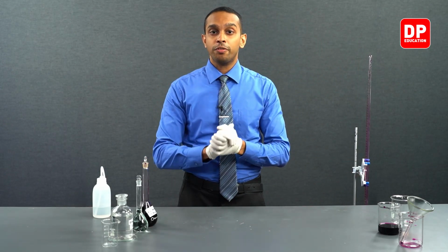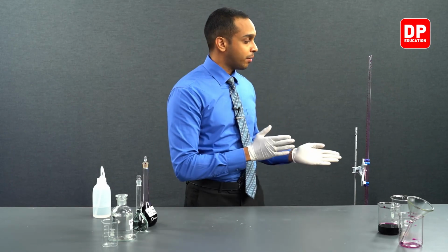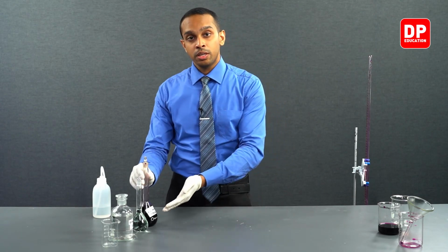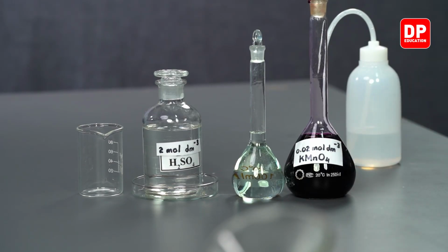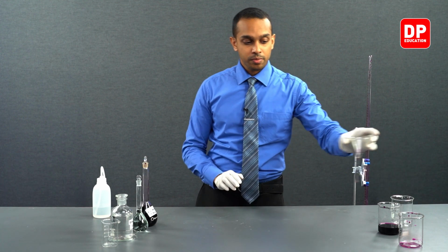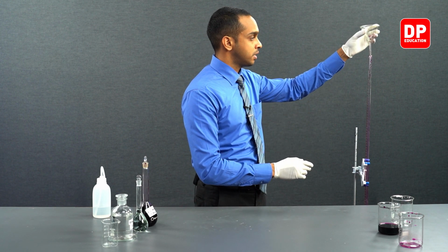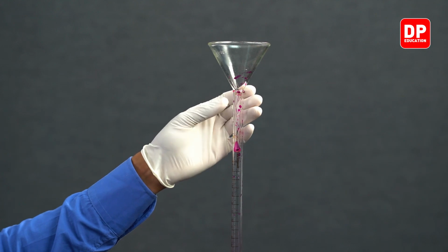Since the washing of the burette is complete, now we will be filling up the burette with the solution that goes in the burette, which is 0.02 moles per decimeter cubed potassium permanganate solution. So let's add that solution onto the burette. For that, we will require a funnel. We will place the funnel over here.